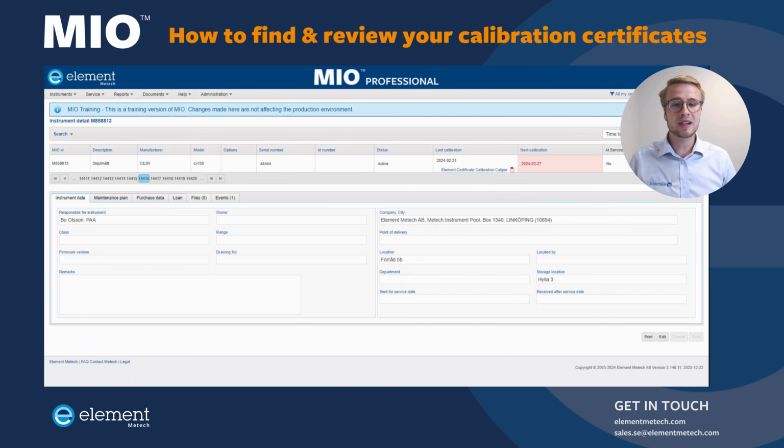So this is a really easy way how you can review your calibration certificates and make sure that all is passed.